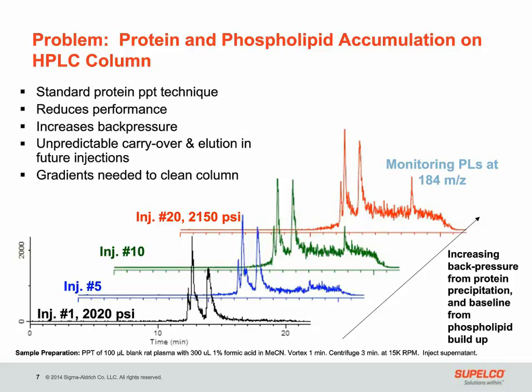The importance of this can be seen here. Without sample cleanup, both the back pressure and the baseline are increased after multiple injections. As you can see from the first injection, our back pressure is 2,020 PSI, and after 20 injections it goes up to 2,150 PSI. The background or baseline also increases dramatically from the first to the 20th injection. These are monitoring for phospholipids at a 184 mass-to-charge ratio. To prevent this, you would generally have to do some sort of gradient at the end of your run to clean off some of these proteins, which increases run length and decreases your throughput.